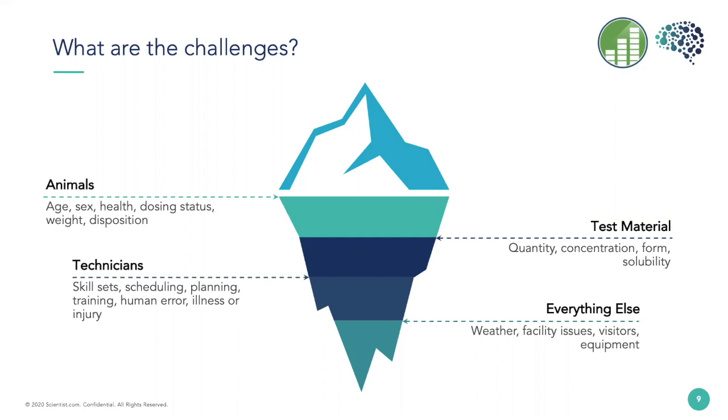Well, usually responding to situations like these results in a crazy rush to get back on track. You're calling supervisors to get extra help. You're telling the study director there's a deviation from the protocol. And during all of this, there's somebody that's creating and printing new paperwork to record dose times and trying to figure out what all the subsequent collections need to be. At this time, they're also printing new blood and plasma or serum labels. They're trying to figure out who's available that can collect those samples late at night or on a weekend. And it's really not an easy thing to tackle, and it usually requires a team of seasoned technicians to sort out.